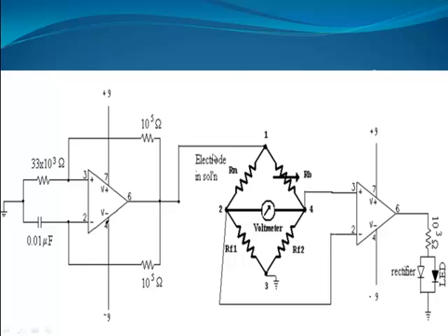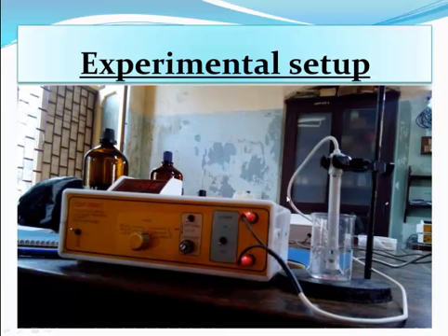So what we do is we make one of the electrolyte solutions or the electrode solutions as one of the resistors in the Wheatstone bridge circuit. From a chemistry point of view, we are not interested in any other kind of circuitry involved. As you can see very clearly, the probe is dipped into the solution.